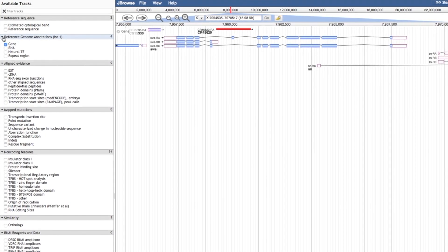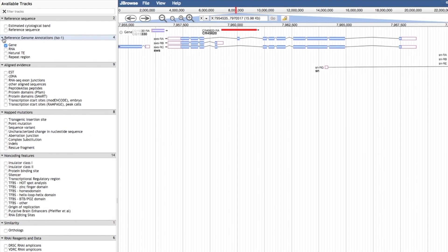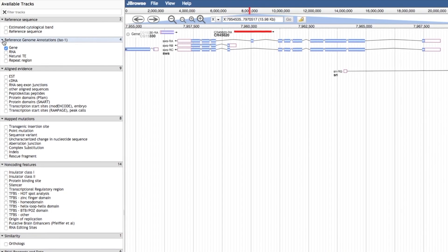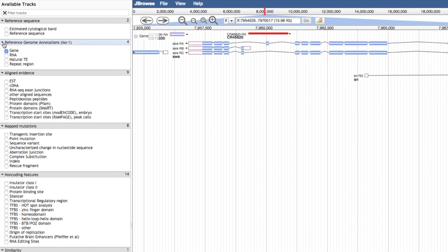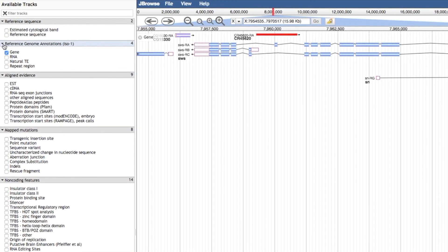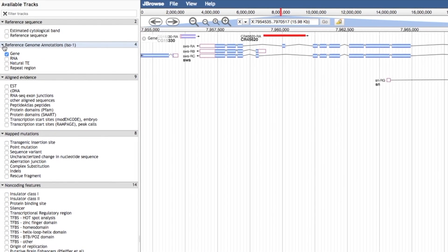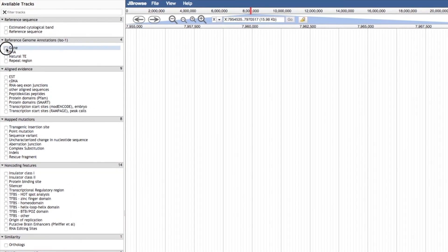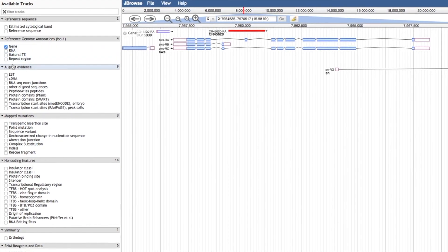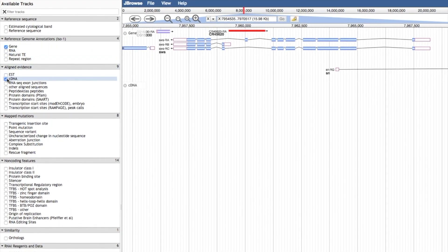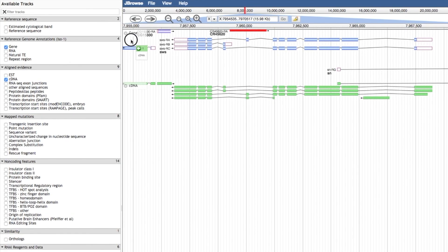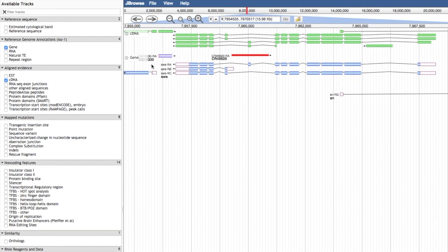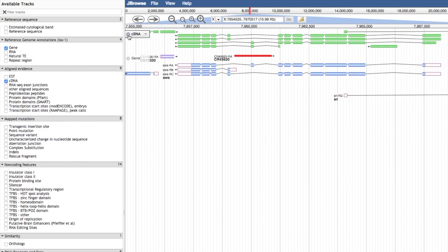On the left-hand side, the Available Tracks panel can be used to select tracks you want to display on the genome viewer. Available tracks are organised into expandable sections. To add a new track to the genome view, simply click on the track name. You can change the order of tracks in the display by clicking on the track title and dragging up or down.